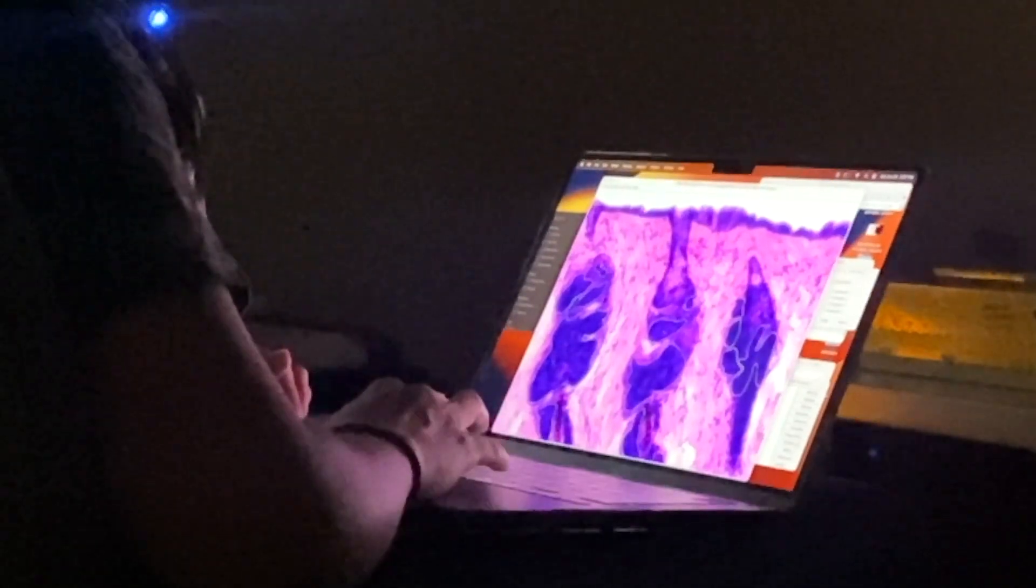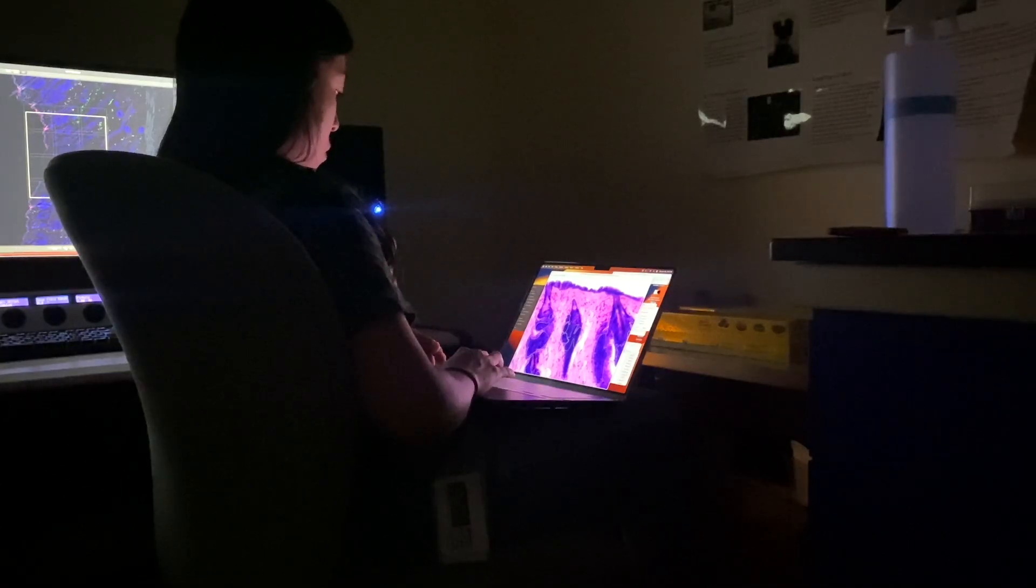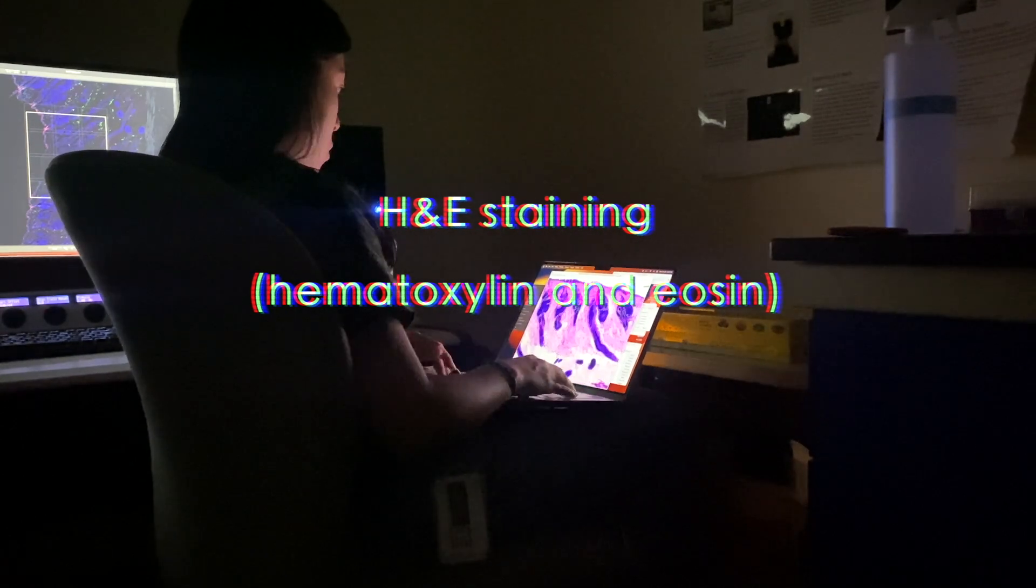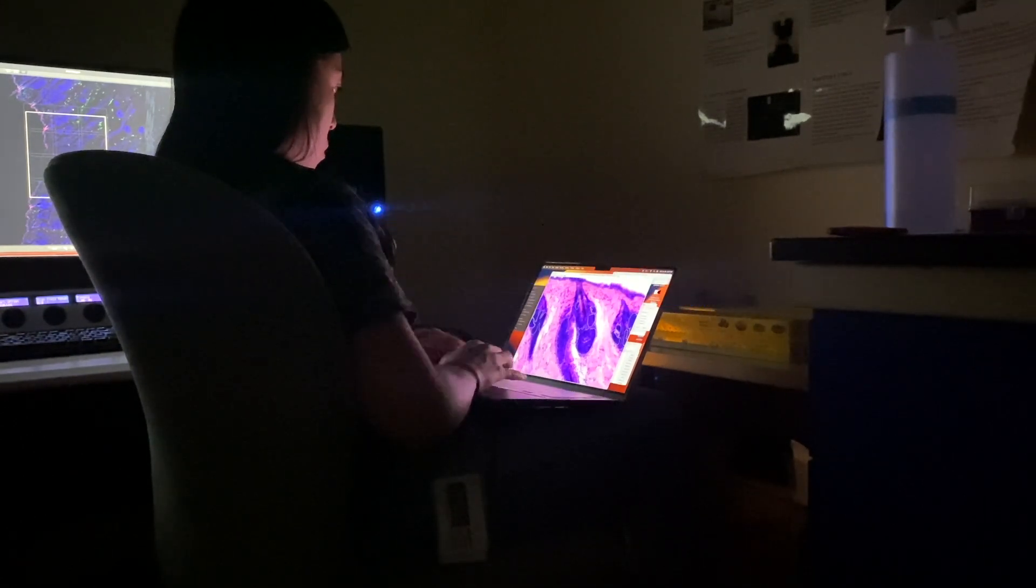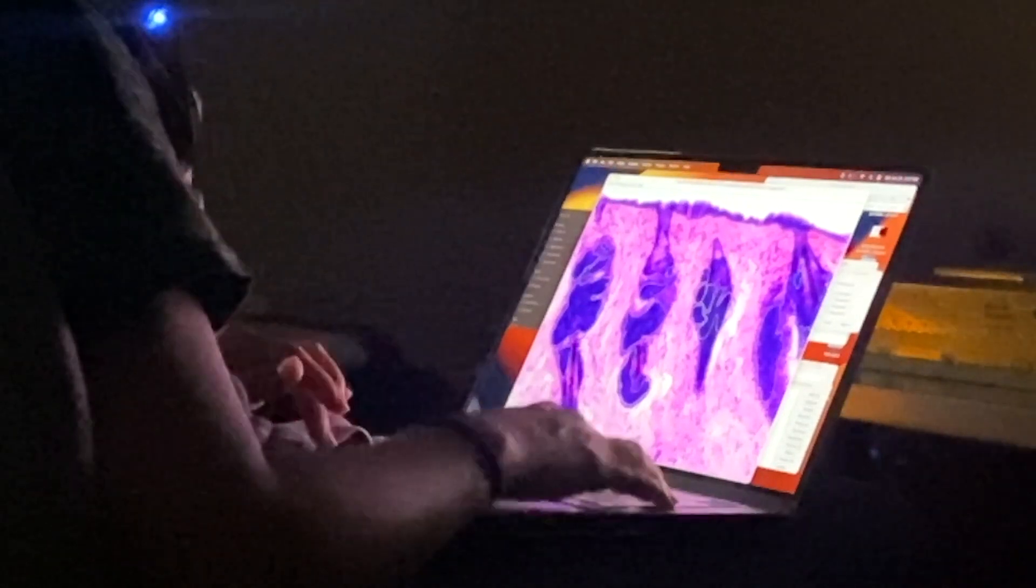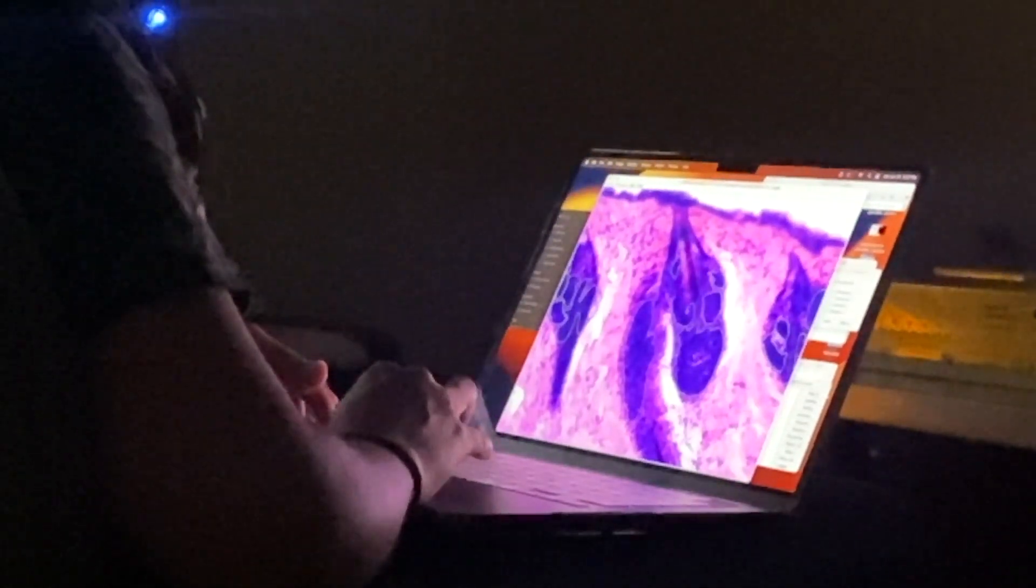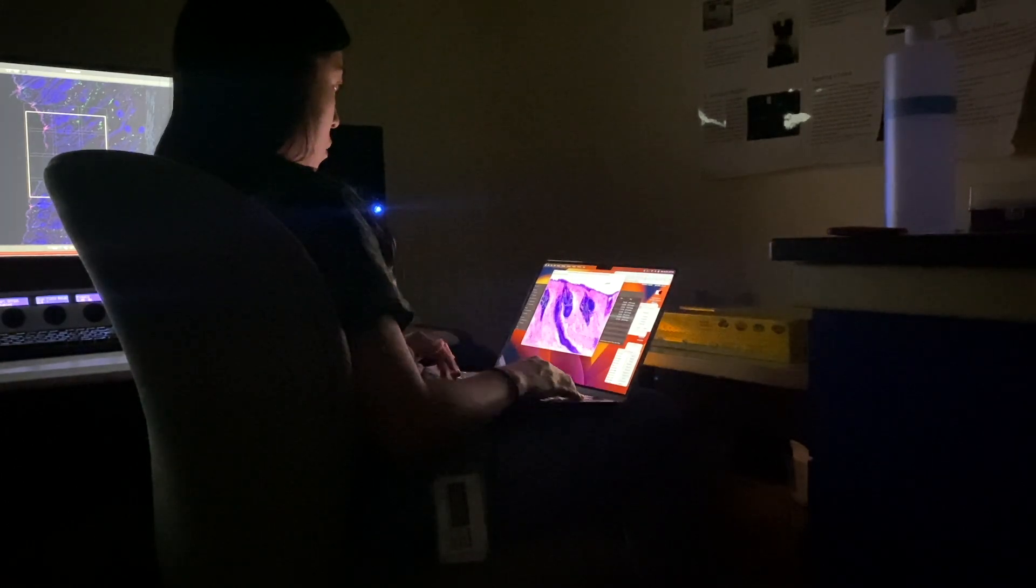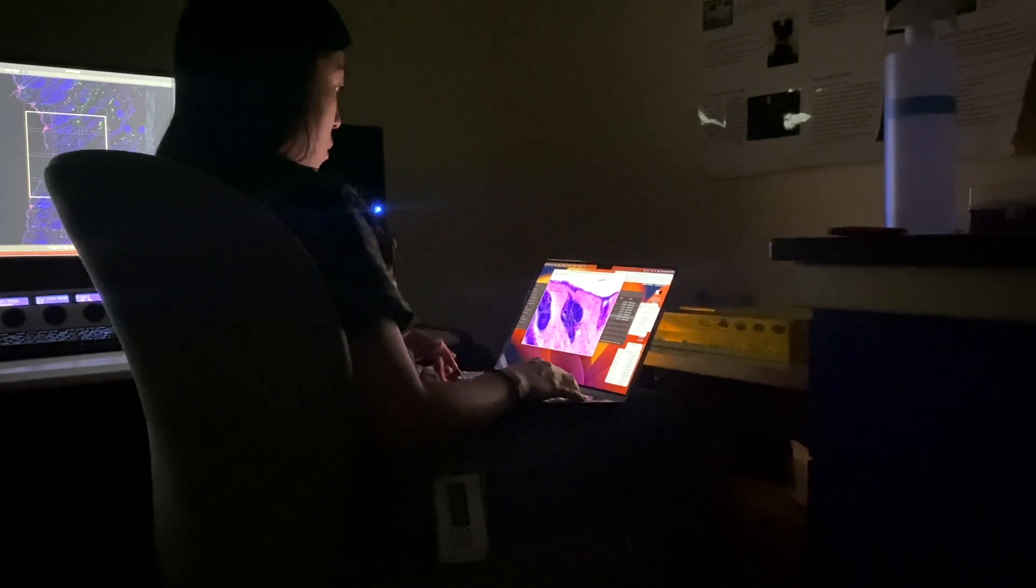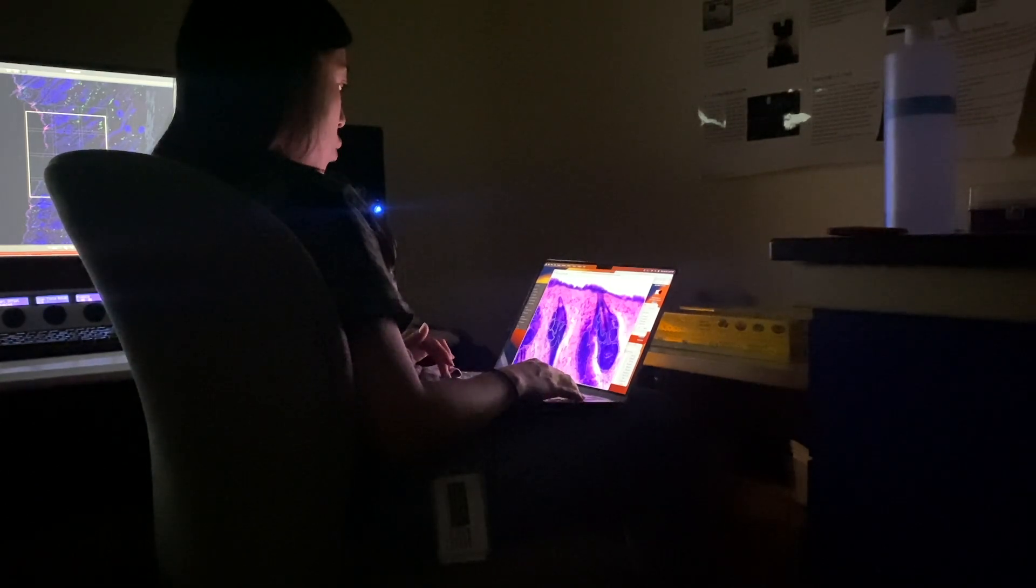So similar samples of skin were processed in a different way. This is through H&E staining, or hematoxylin and eosin staining. That leaves this pink and purple stain of basic structures in a tissue. Doctors use this often to quickly look at histology, or histopathology. For example, taking a biopsy and seeing if a growth looks like it could be cancer.